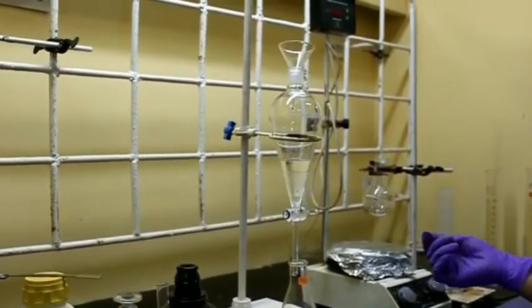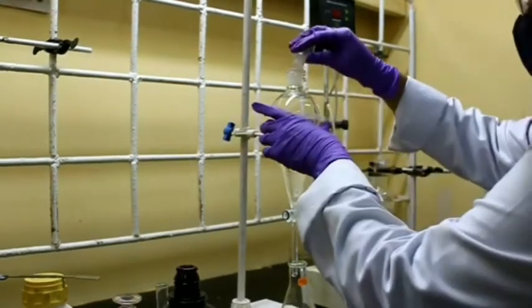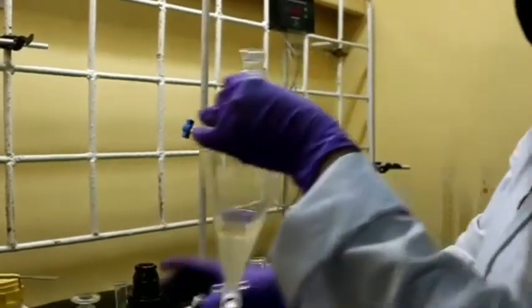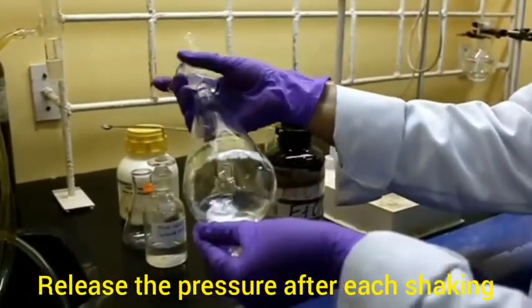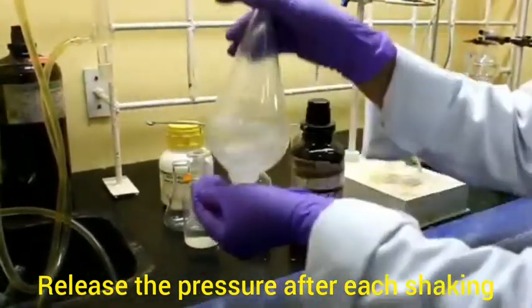Then remove the funnel stopper. Tap the separating funnel and shake the separating funnel vigorously and release the pressure after each shaking.